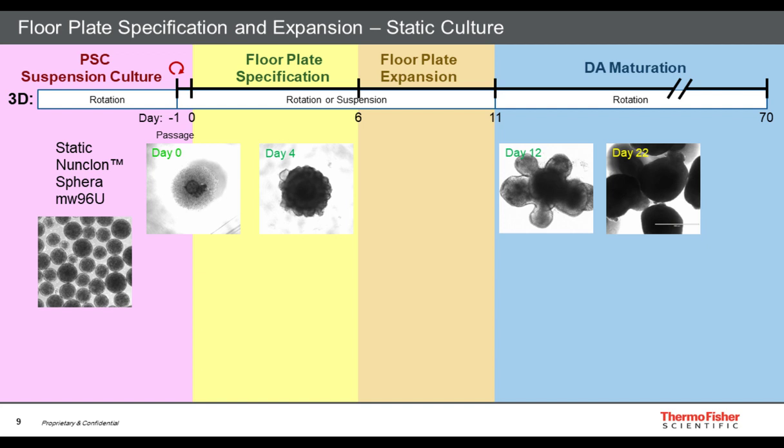These small spheroids respond to the addition of specification media by growing out bubbles of epithelium, similarly to what we saw with the ECM embedding. But this time, switching into expansion media allows those epithelial bubbles to grow outward without any constraint. And by 3 weeks, these have thickened to give very irregular shapes, but at least the sizes of the organoids are somewhat more uniform. So we decided once again that we should add extracellular matrix during the specification.